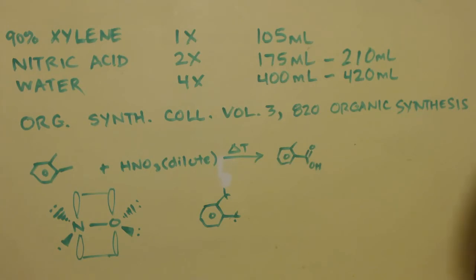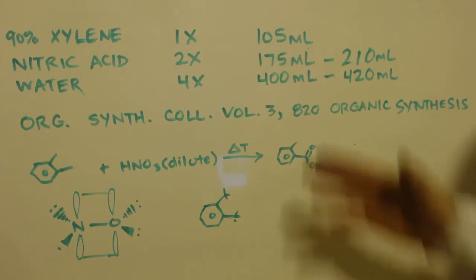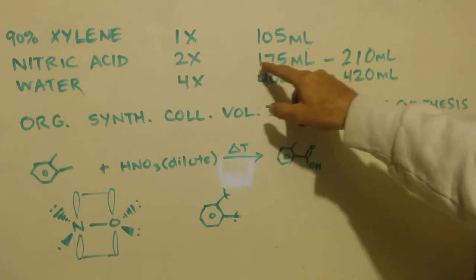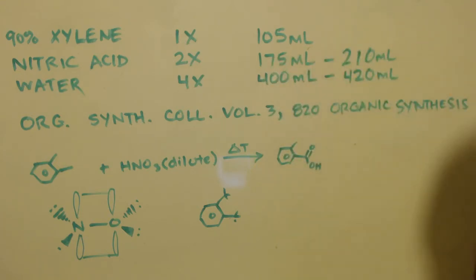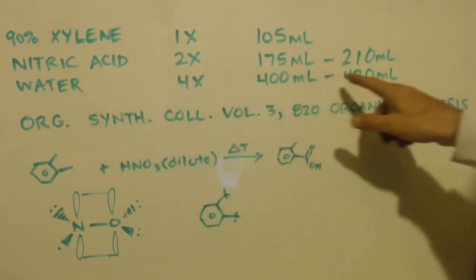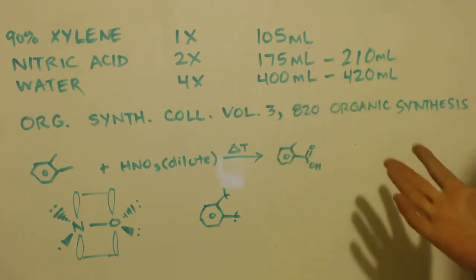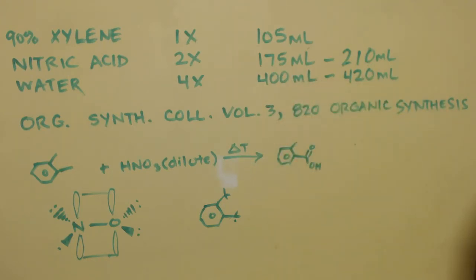That's all I had. So that also played a part in me having a low yield. 30 milliliters, that's like a 20% loss right there. The water, I should have put in 420 milliliters. I put in 400. I don't think that would have made any difference at all. But the nitric acid, definitely, that would have cut my yield down 20% easy.